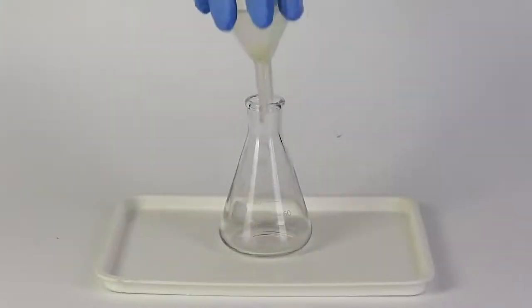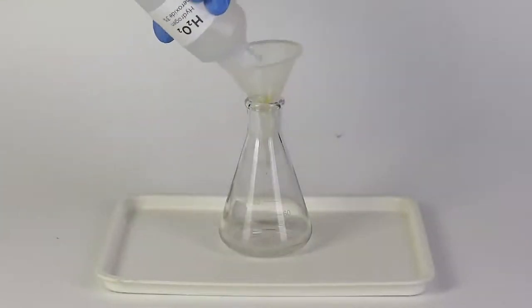Take the flask and put the funnel into it. Pour 40 milliliters of the 3% hydrogen peroxide solution into the flask.